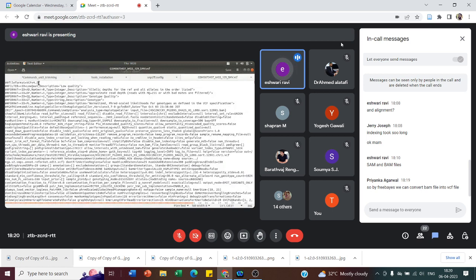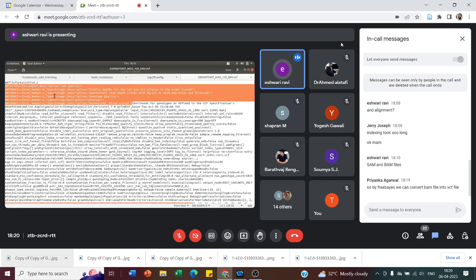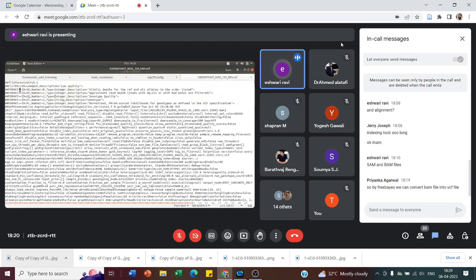So this is the file format, which says that the file is a VCF file, and then it mentions all the filter options we have. As I said, you can choose to print only a particular type of variant. You can have the allelic depth, the approximate read depth, the genotype quality, everything. If you want, you can specify. If you don't want, it will take the default values, which are standard. Even the Phred quality score will take the default ones. This is the header part, right from the GATK command line, HaplotypeCaller.